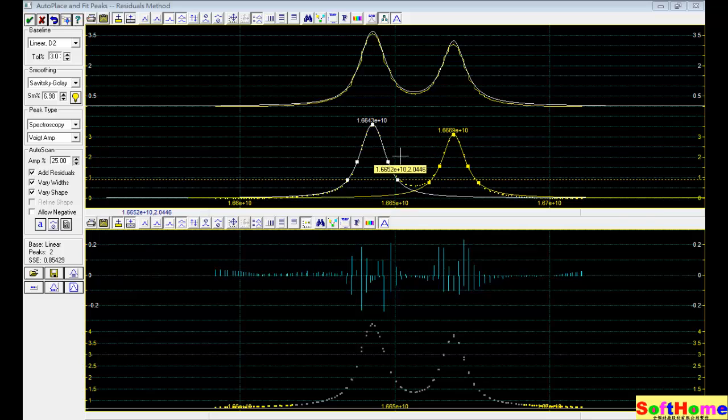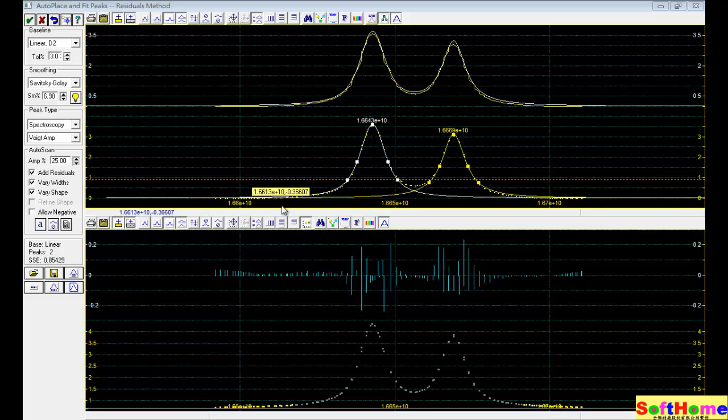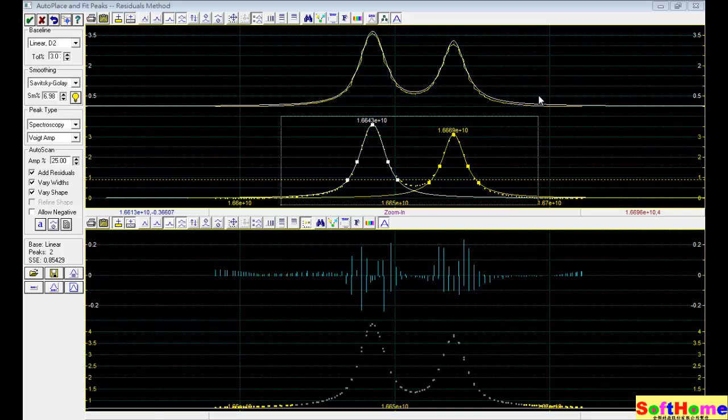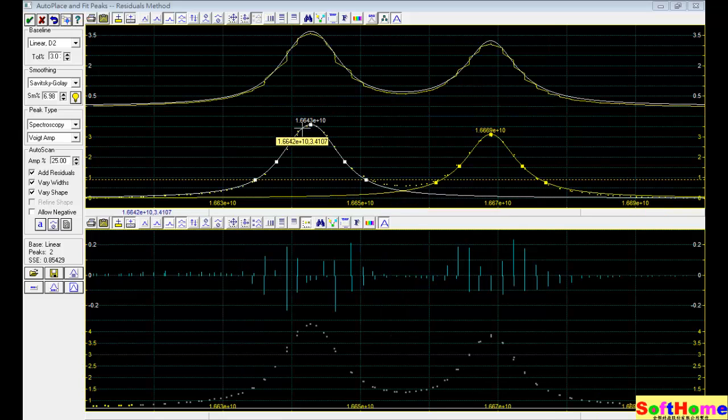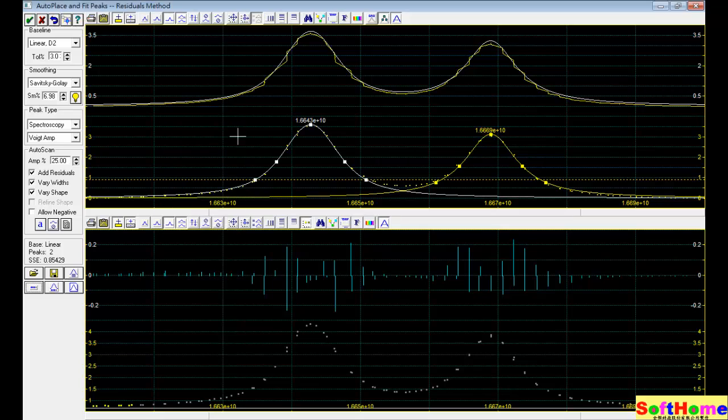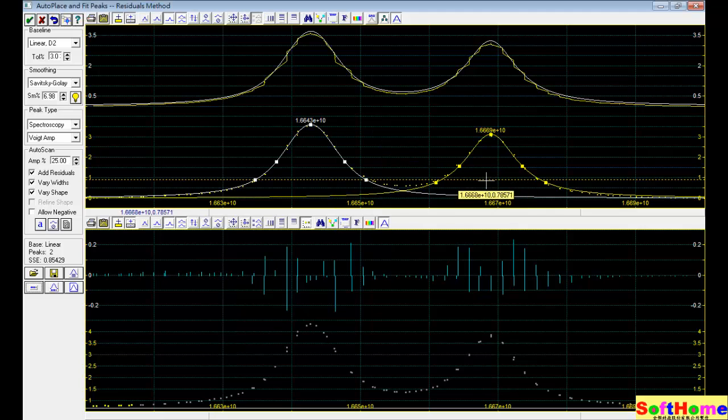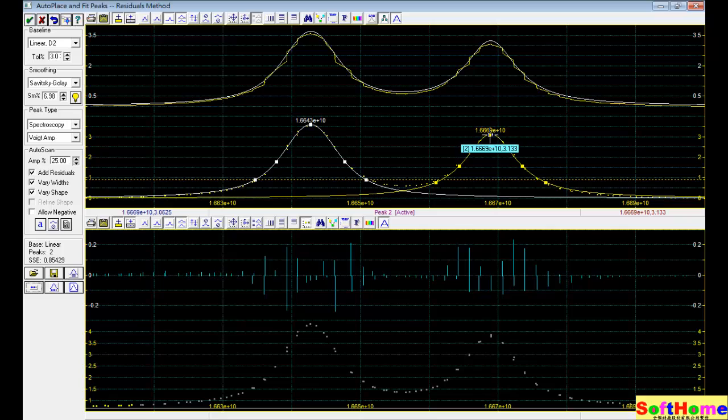You can use keyboard to adjust the parameter. Magnify the view. And you can use the right click. This is the second peak. Left, right click. Right button in the mouse.